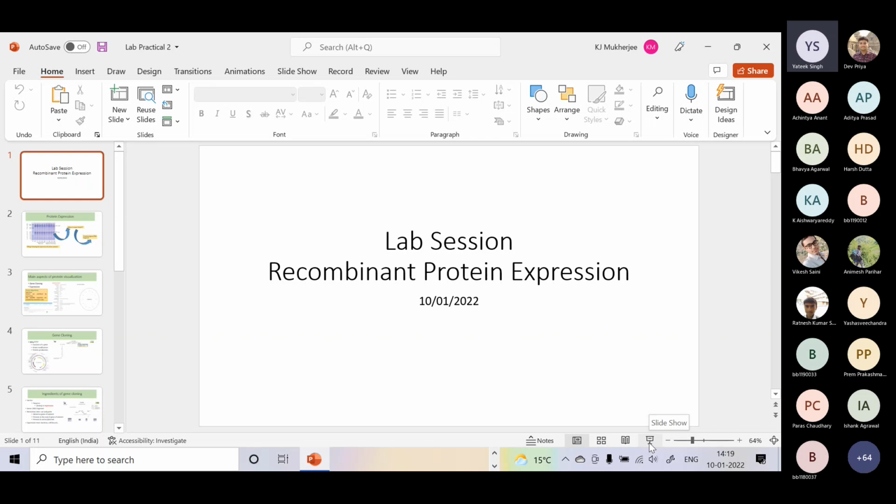The in silico part helps you narrow down many problems, and at the end of the day, when you go to the lab and to the workbench, you just have to do the pipetting because all the rest has been already planned and done in silico. So the in silico part is very important in today's cloning and all kinds of molecular biology work. Are you familiar with any softwares or in silico processes which assist in cloning or help you with primer designing and all those things?